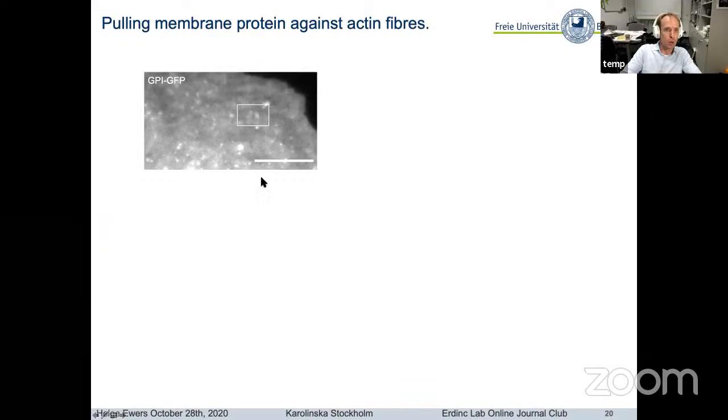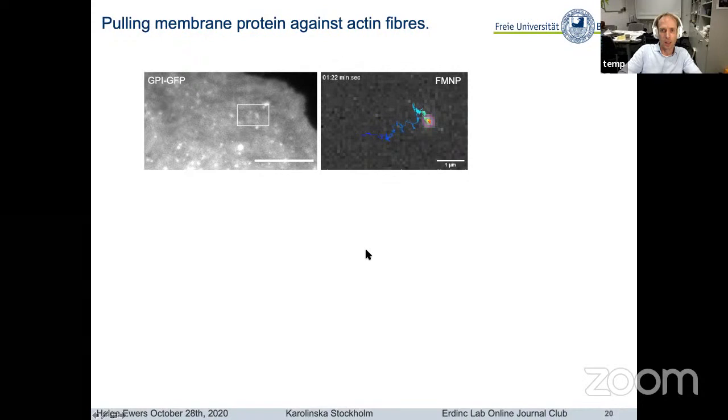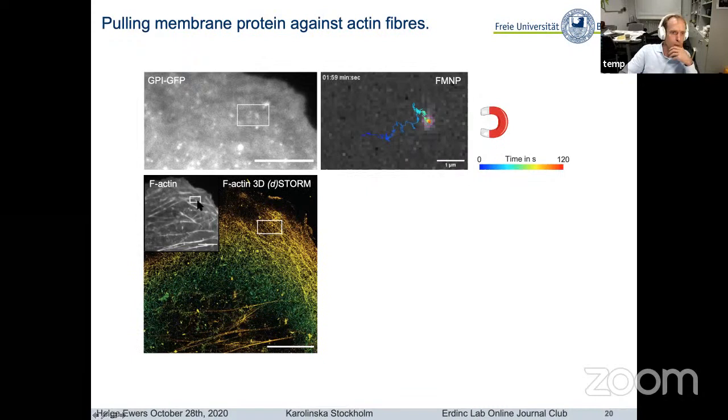Here you can see again GPI-GFP expressed in a CV1 cell. We can then see as we pull this molecule through the membrane, it kind of hits a barrier, slides along that barrier, and then it seems to get stuck. This is where the magnet is. So it tries to move towards the magnet, and then it somehow hits a barrier, and it finally gets stuck. Now if you look at the same area in wide field actin imaging, we can see that there's some prominent actin structures there. This is the dorsal actin in the 3D STORM.